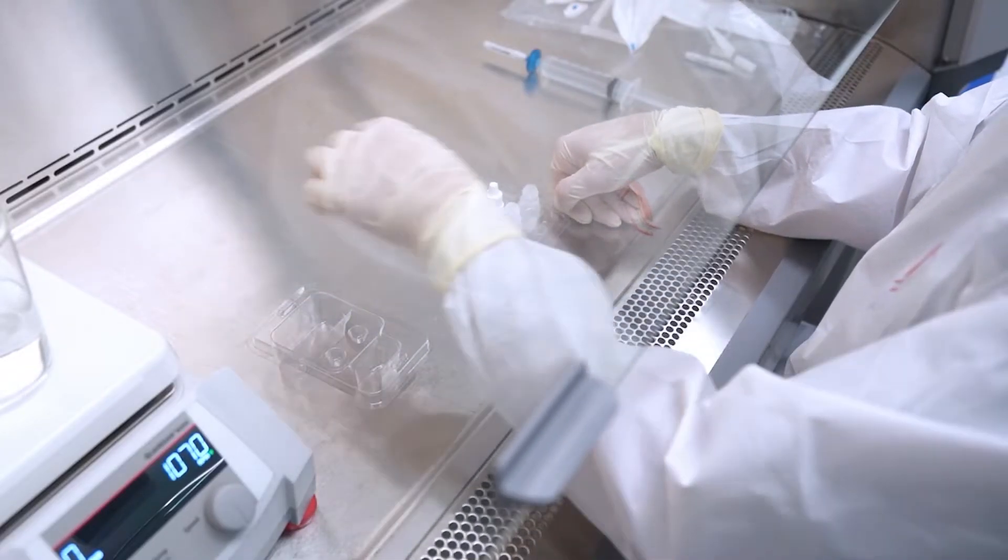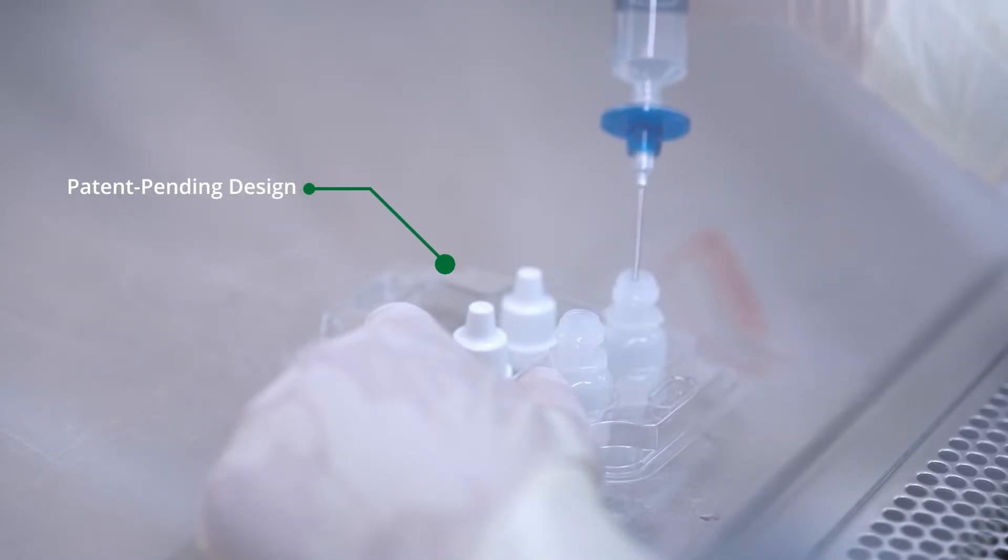Bottles are packaged in fixed grooves on a patent-pending ergonomically designed tray that facilitates the filling process while reducing cross-contamination risk.